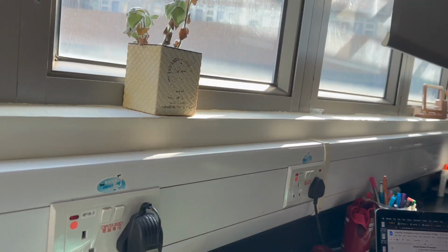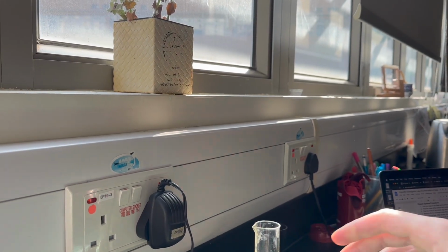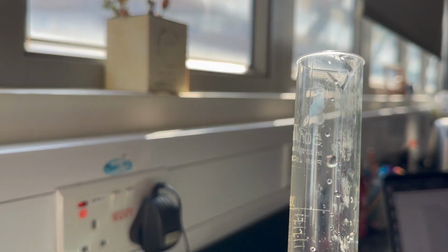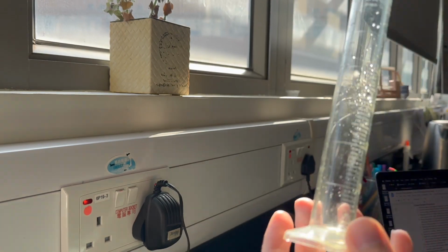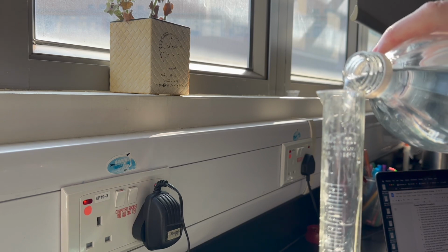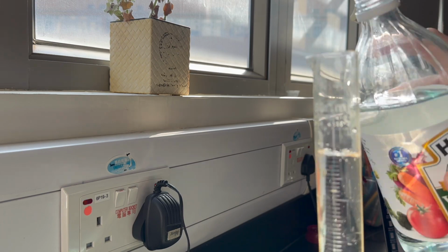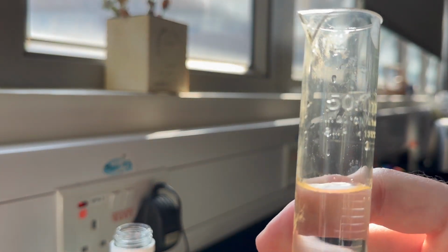Okay, and then we need our vinegar. So 50 milliliters of vinegar. Here's my graduated cylinder. And I need 50 milliliters. There we go, 50 milliliters.